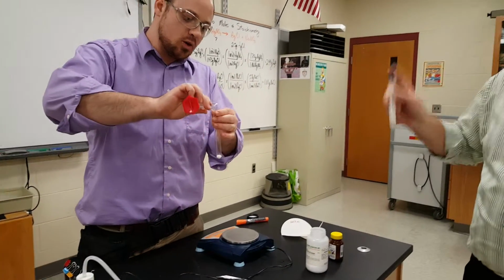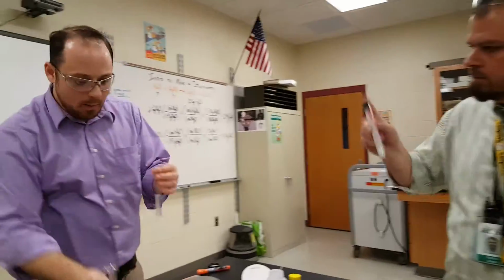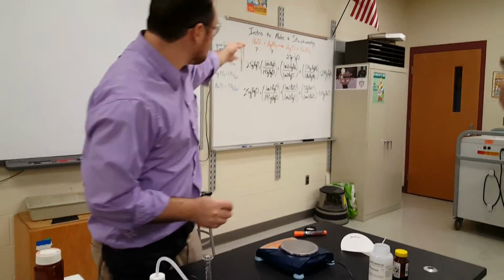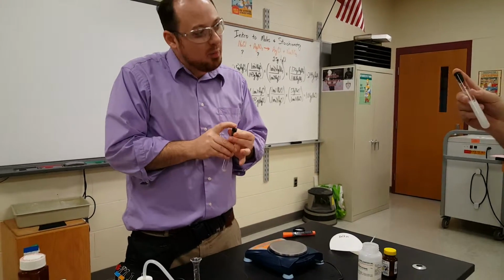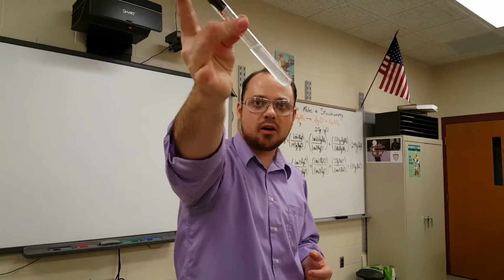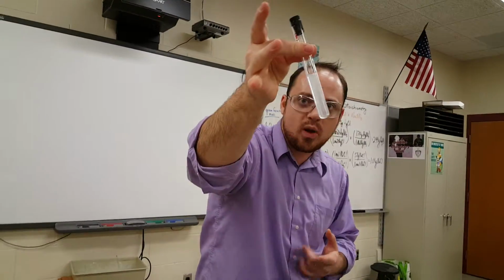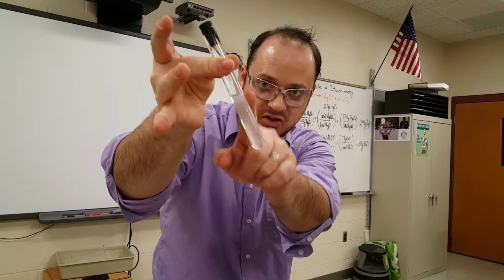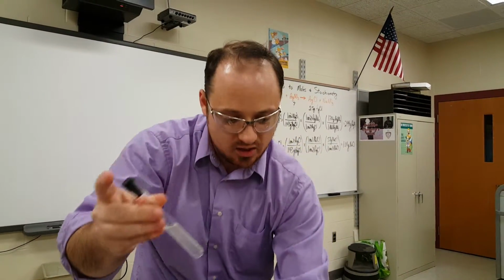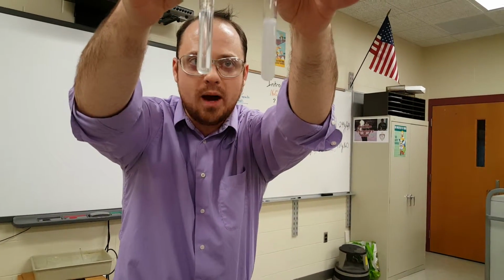Again, I need these two chemicals to be in liquid form to react properly. If I mix the two powders, according to the equation up there, they're supposed to react, but in reality it would happen really, really slowly. So when we get these ionic compounds dissolved in water, the ions are free to move around, and when they bump into each other, they will react. So when the ions in here that have dissolved and dissociated react with the ions in here that have dissolved and dissociated, we'll get more white powder.